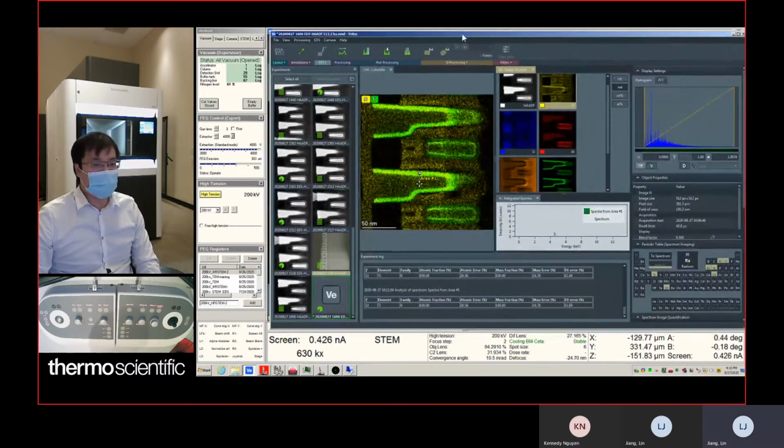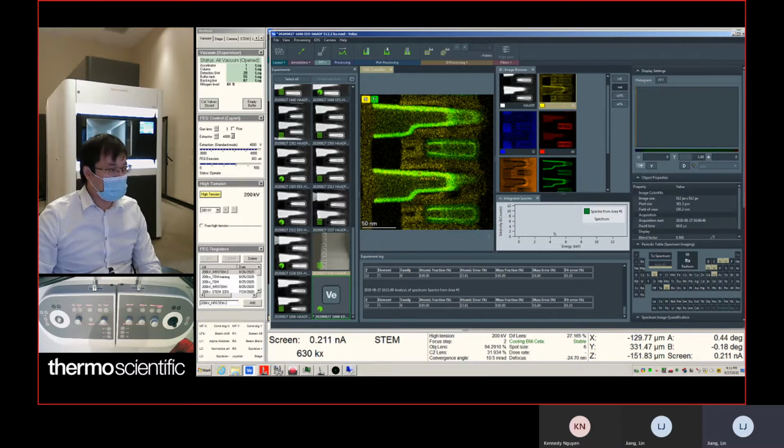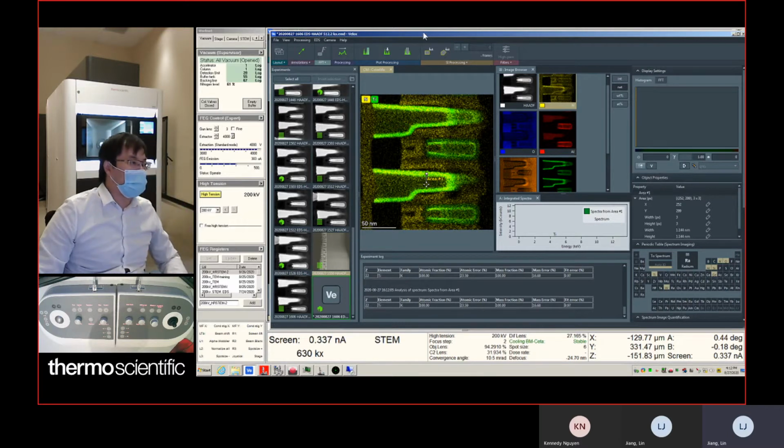Oh, still running. Okay. I think it's almost done.